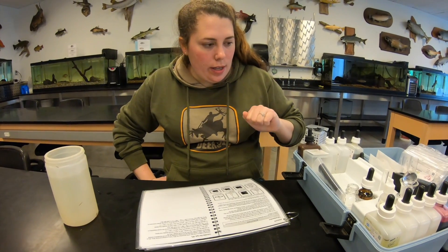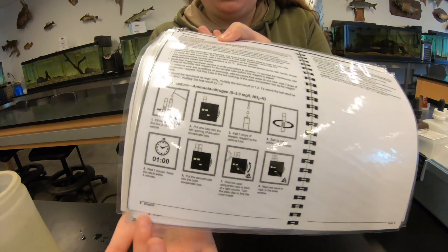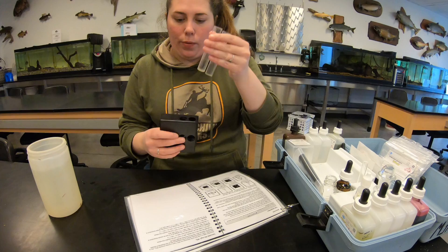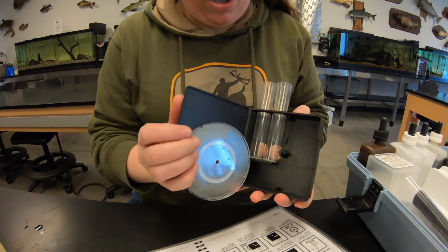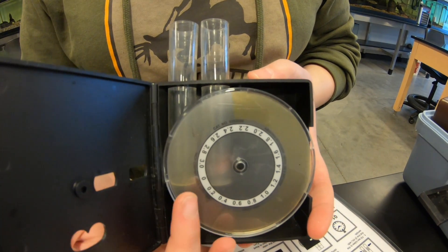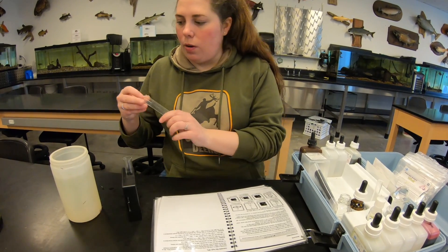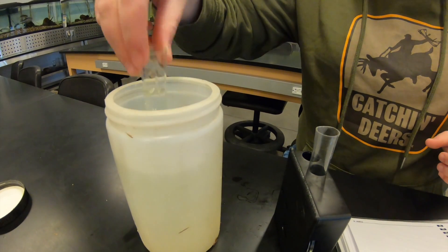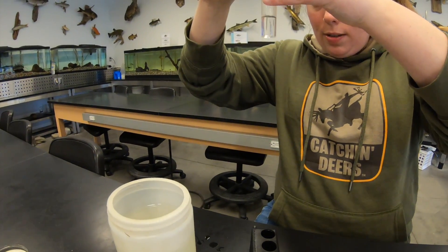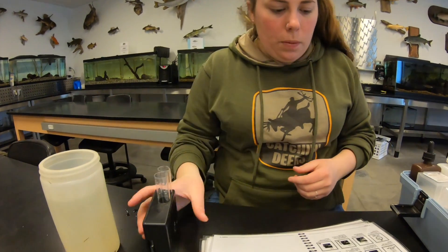For our last test using the Fish Farmer kit, we're going to look at ammonia. The packet gives you all the directions. First, grab the two viewing tubes - not to be confused with the measuring tube. There's also an ammonia color wheel, which helps you determine how many milligrams per liter of ammonia are in your water body - I'll show how we use this in a few minutes. We fill both test tubes to the first line, which is five milliliters.